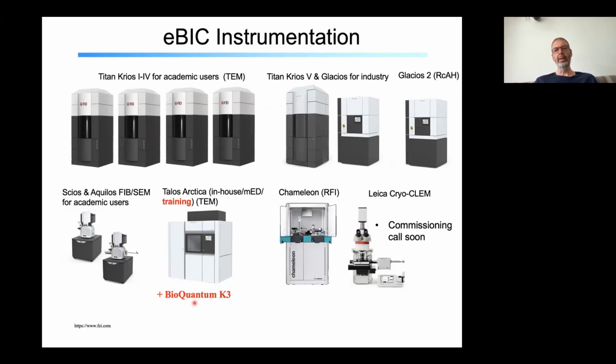We have recently moved our Bioquantum K3 onto our Talos. This is our in-house machine, but we're also going to put a lot of the training that we're going to offer onto this machine. And we're also just about to put out a call for microED.